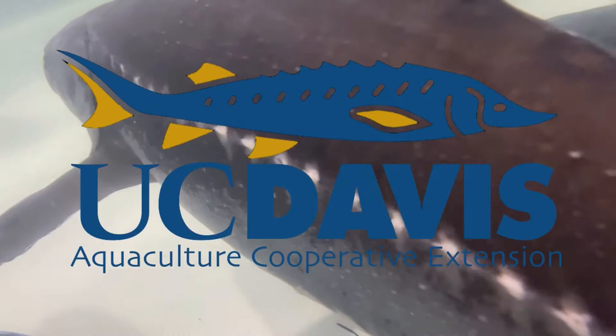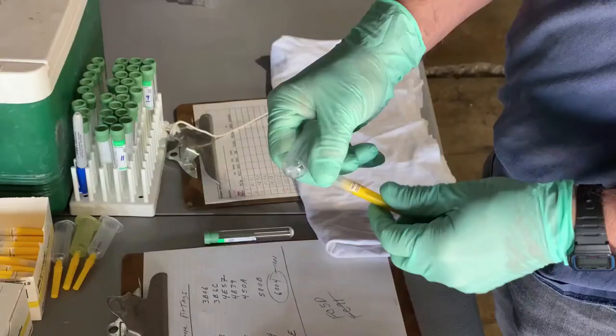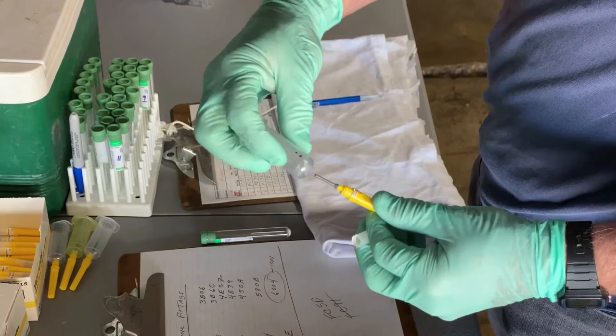In this video, we are going to show you how to collect blood from the tail vein of a fish. We will be drawing blood from a white sturgeon using a needle holder, a one and a half inch long, 22 gauge syringe needle, and a heparinized vacutainer which is used to prevent the blood sample from clotting.